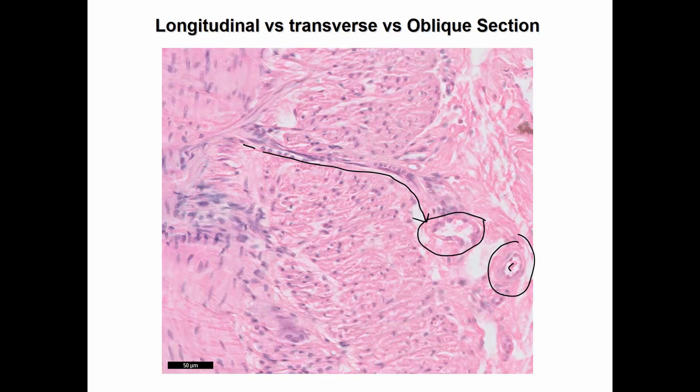So remember, when tissues are sectioned, the vessel doesn't say, let me make your life easier and just straighten out. It's wavy. So you can have the same vessel sectioned in plane, out of plane, in plane. You see that? So that's what you want to start to appreciate when you start looking at histological sections.